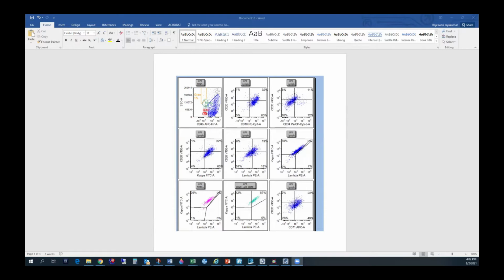It's that rocket shape, like we were discussing last time. It's neither in the kappa nor in the lambda. That was abnormal. It's not like it needs regating. So this is debris. If you look at it, you will see this in the same location, almost the same shape. The location may be a little bit here and there, but you see the same diagonal shape in all the plots.